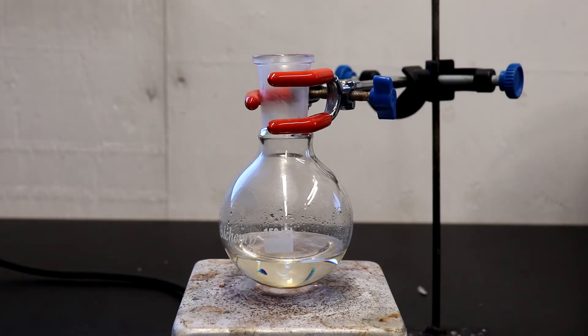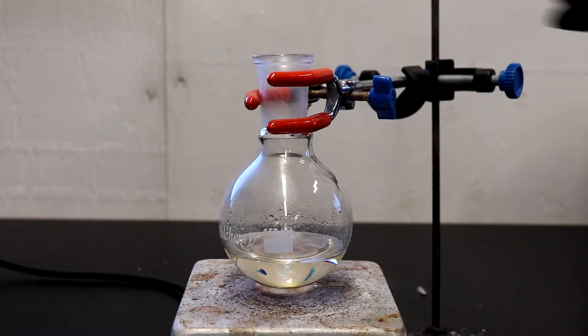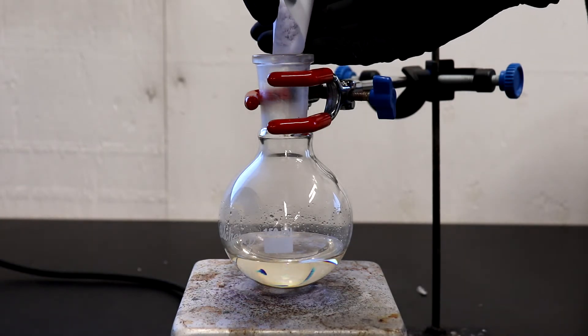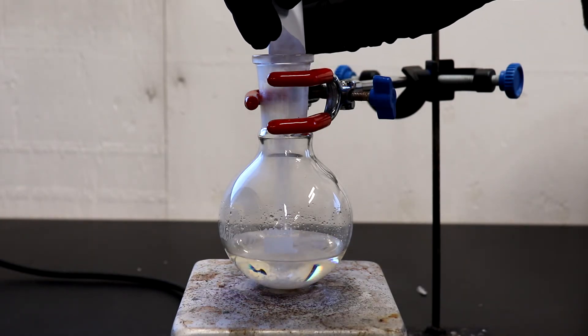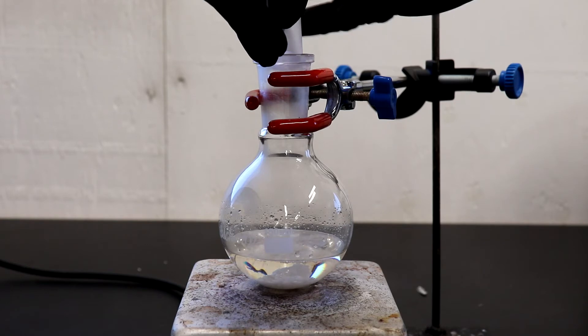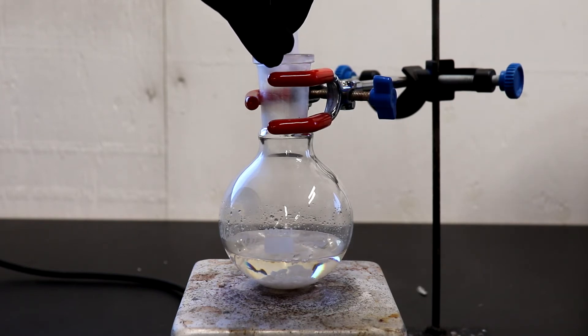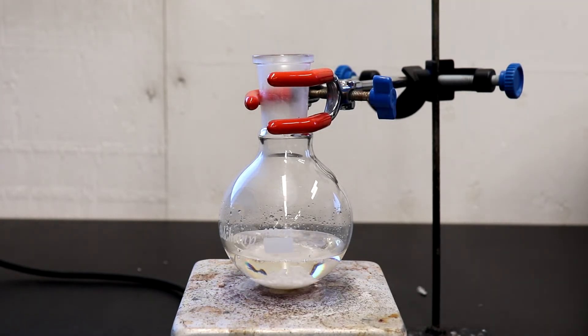Okay, and to the crude aniline I'm going to be adding 8.5 grams of potassium hydroxide. And I'm also going to be adding a stir bar.